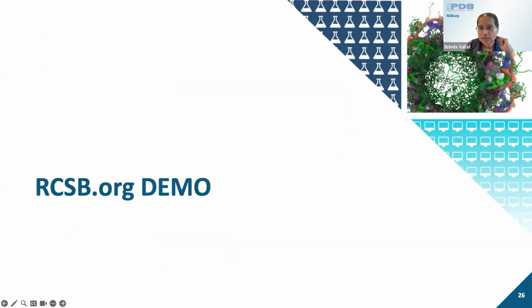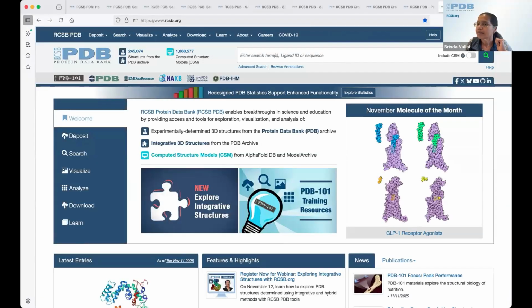Okay, now I want to switch my screen and share my screen. All right. Okay, let's move to the demo part: how you can explore integrative structures on rcsb.org, the tools and functionalities that we have on rcsb.org.